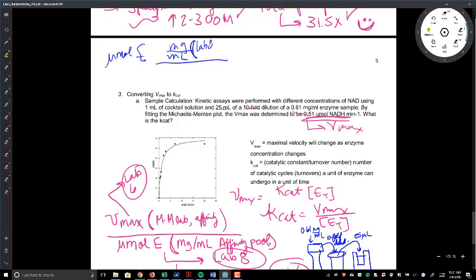We divide it by the dilution factor, and that comes from lab 6, and then we multiply by the milliliters added to the cuvette, which you would go back and find from lab 6, but as I recall, is always 0.025 mL.